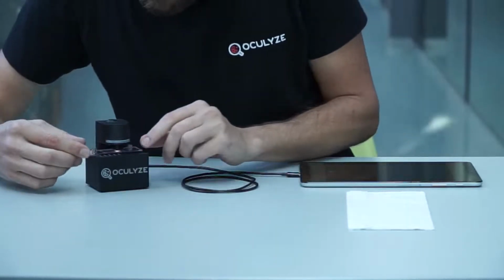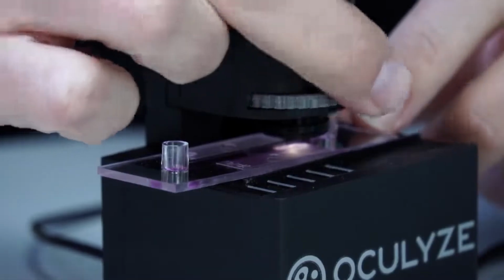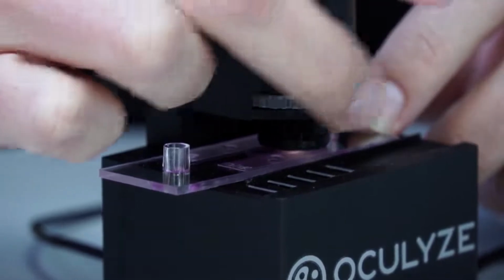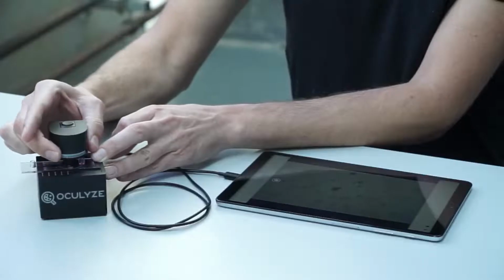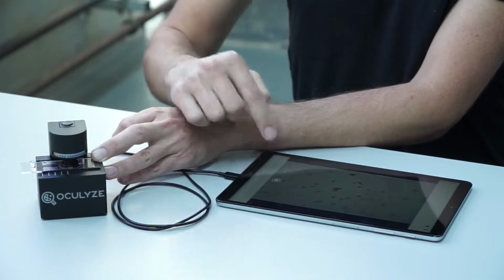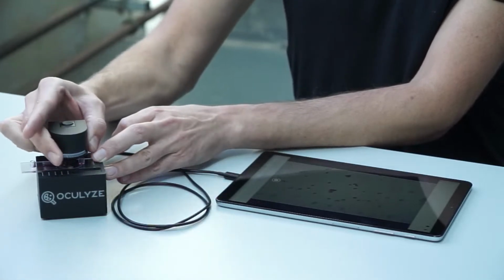Slide the sample chamber up to the first marking, lightly screwing it into place, turning the focusing wheel counterclockwise. Step 4. Continue focusing until cells come into focus. You will feel the wheel tighten slightly as the pad comes into contact with the chamber. Be sure not to over-tighten, as this can damage the chamber or the optics.